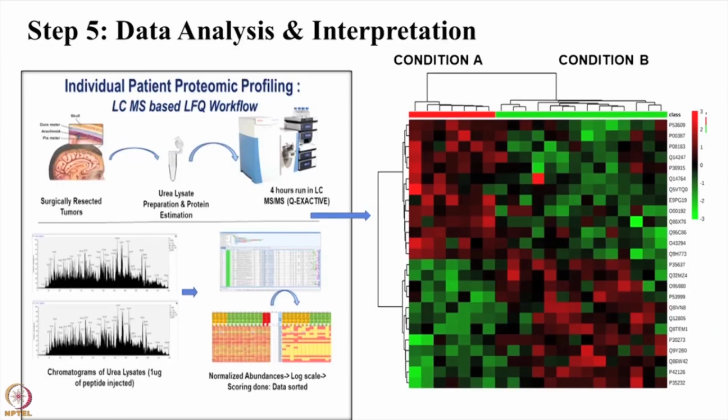So basically we have started from here, that is, we have taken a cancer sample and normal samples, used a patient cohort, then extracted the protein, and then run the samples in the mass spectrometer. After doing all these exercises, you have got raw values, you have got different peaks that you need to identify. So you have used a software, which I told you can either be a freely available software like MaxQuant or a licensed software, whichever resource is available to you, and then you can use the software and its various parameters to do the data mining.